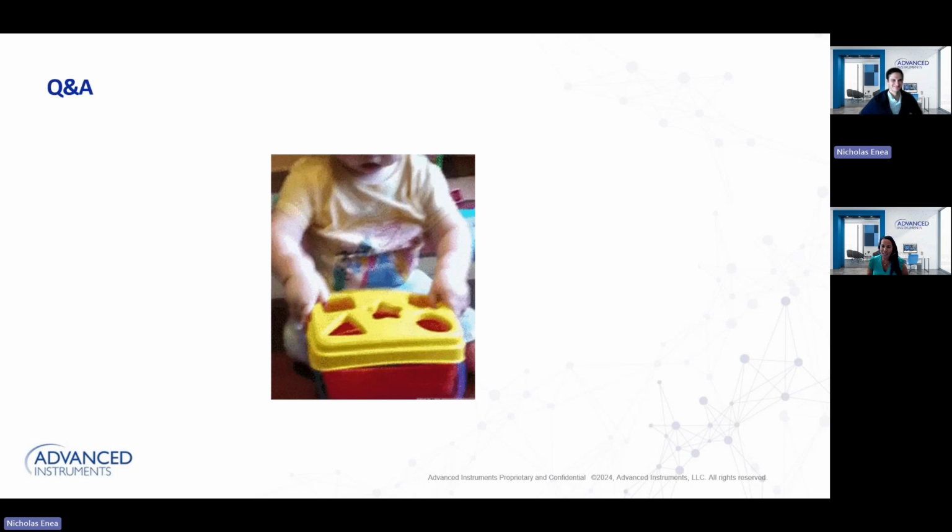So thank you, Jose, for that question. The answer is it depends, which is everyone's favorite answer, of course. It depends on the pipette manufacturer and their micrometer adjustment tool. For example, I know with Gilson, with their adjustment tool, they recommend that you make micrometer adjustments at the very lowest volume. But with the Rainin LTS tool, for the LTS pipettes, they don't have a specific recommendation on what volume you make that adjustment.